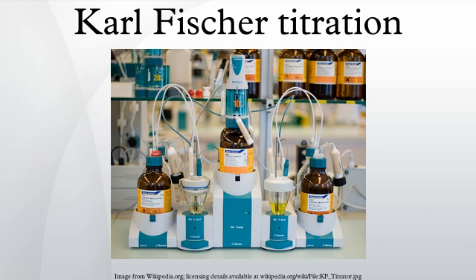A second pair of Pt electrodes is immersed in the anode solution. The detector circuit maintains a constant current between the two detector electrodes during titration. Prior to the equivalence point, the solution contains I- but little I2. At the equivalence point, excess I2 appears and an abrupt voltage drop marks the endpoint. The amount of current needed to generate I2 and reach the endpoint can then be used to calculate the amount of water in the original sample.